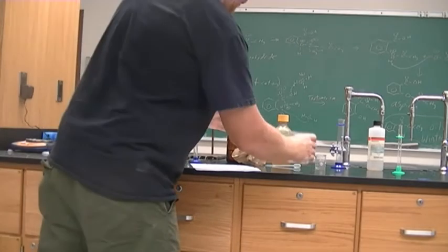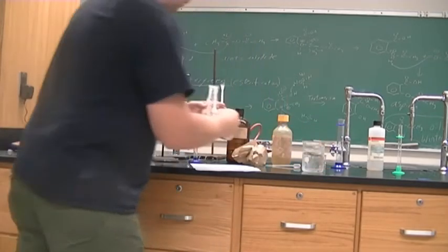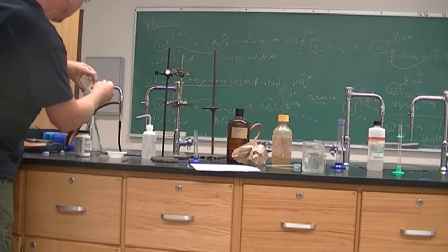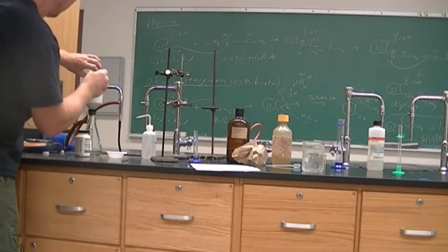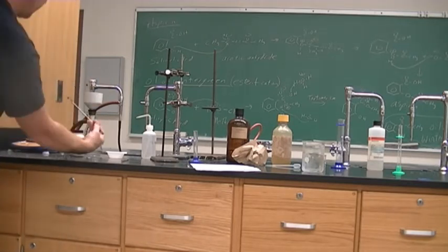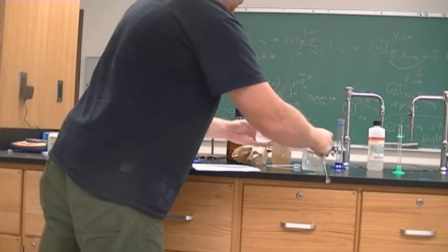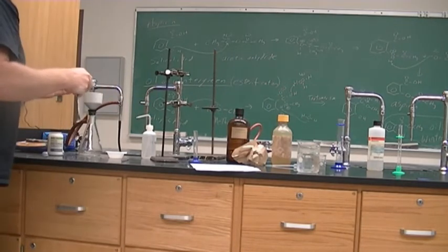which will clean it. Now, you have solubility, so whenever you're washing, you are dissolving some of your product, but you are also washing away any impurities that are on it as well. You can see the water that I put in there getting sucked through the filter. A couple more washes with this ice cold water.